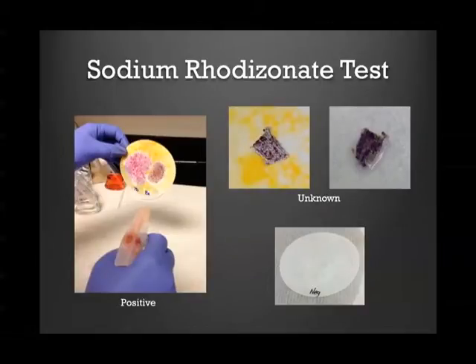The sodium rhodizonate test for barium and lead was performed on an unknown deposit on a t-shirt. A sample of the t-shirt was saturated with the sodium rhodizonate solution. An examiner would expect to see a yellowish-orange color. When the buffer solution is added, the sample should turn pink, indicating the presence of lead, and reddish-brown for barium. If hydrochloric acid is added, the color should change to a deep violet blue for lead and bright red for barium.